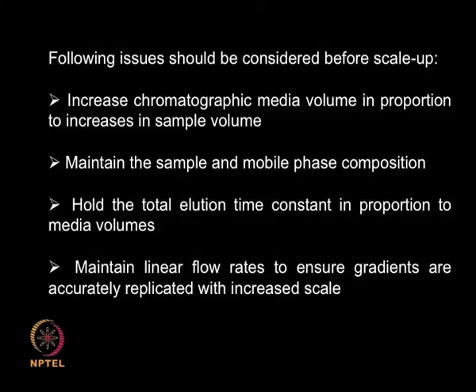When you are scaling up, we have to consider several other factors. We have to increase the chromatographic media volume in proportion to the increase in sample volume. So if I am going to have a large sample volume, that means I need to have more chromatographic media volume. But at the same time, I need to maintain the sample and the mobile phase composition the same.